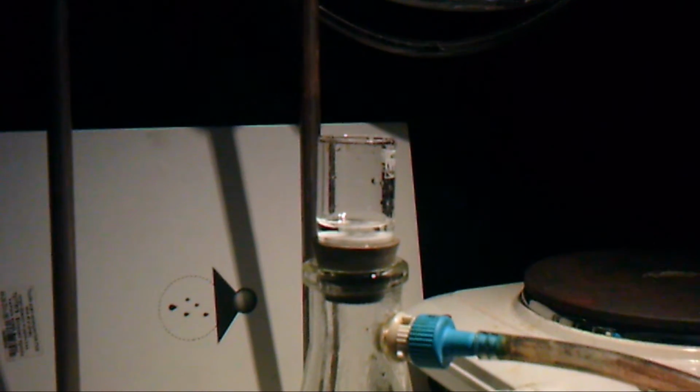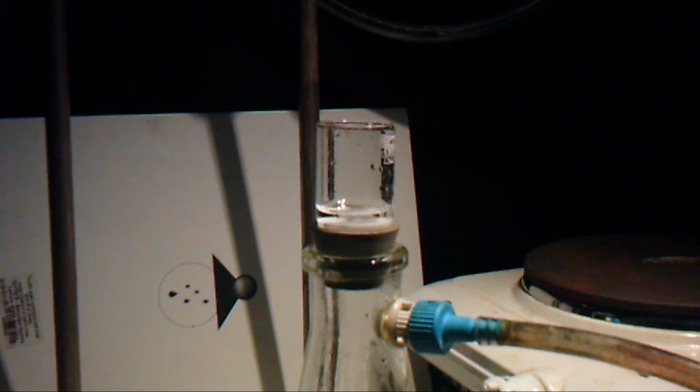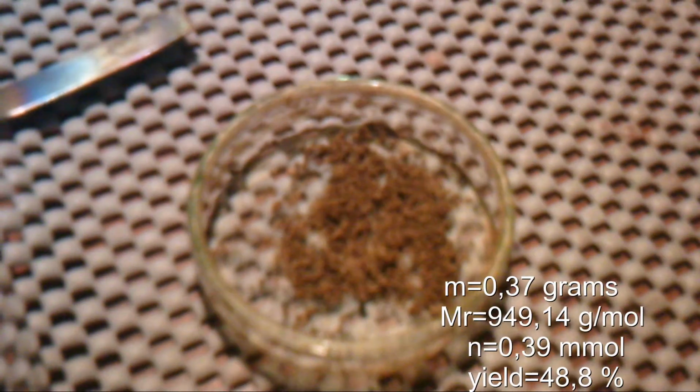From the other side, the filter is very clean, so this is how clean our filter is after this hydrochloric acid and after deionized water. So let's take a look at our product.